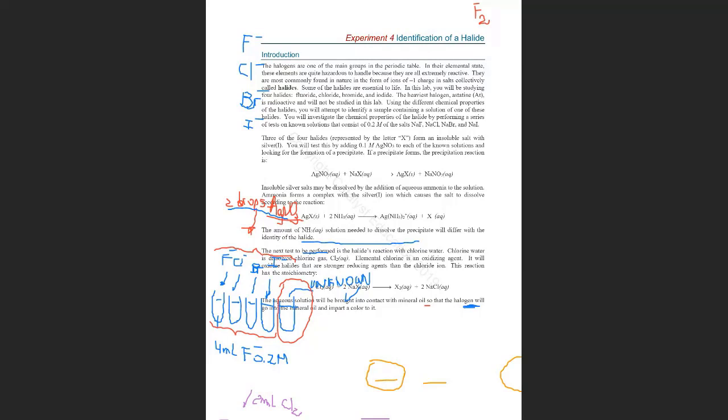You are going to be given all that data because you are not in the lab doing the experiment. You are going to be given it, and then you will have to say, comparing depending on what your unknown gives, what change in the reaction, okay, I have bromide or iodine, or it's going to be any of the four.